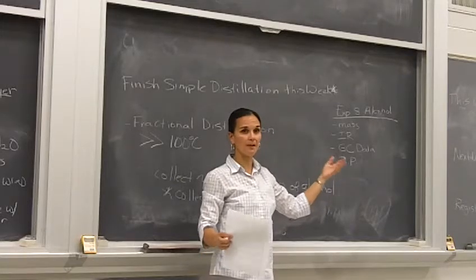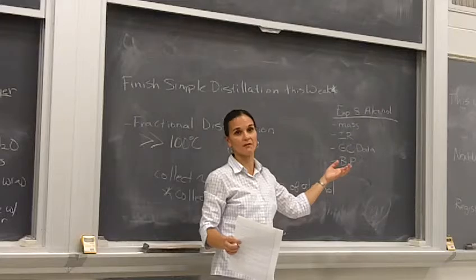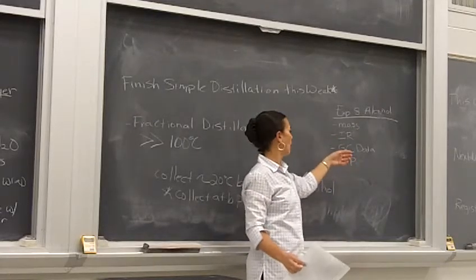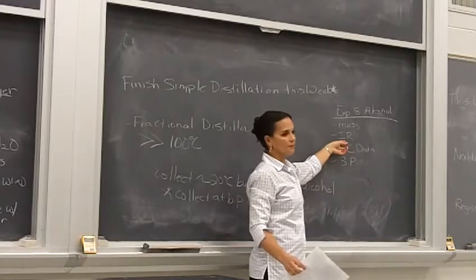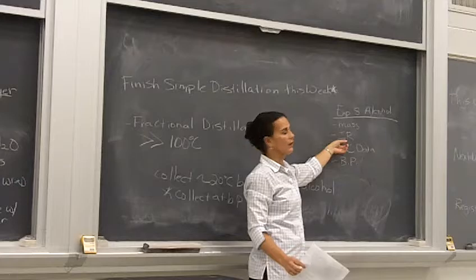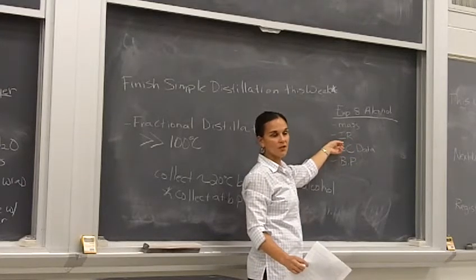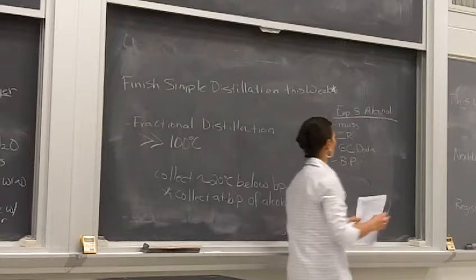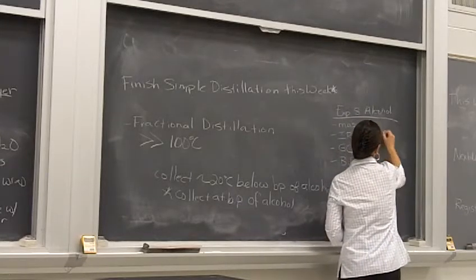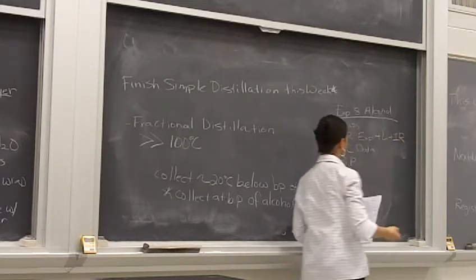Then you're talking about primary and secondary alcohol, so their IR spectrum is going to look a little bit different, okay? But if you've got something that's structurally similar, like 3-octanol instead of 4-octanol, then you'll be okay with that IR spectrum, okay? So eventually you will need that. You'll also need your experimental IR, and then you're going to need a lit IR as well, okay?